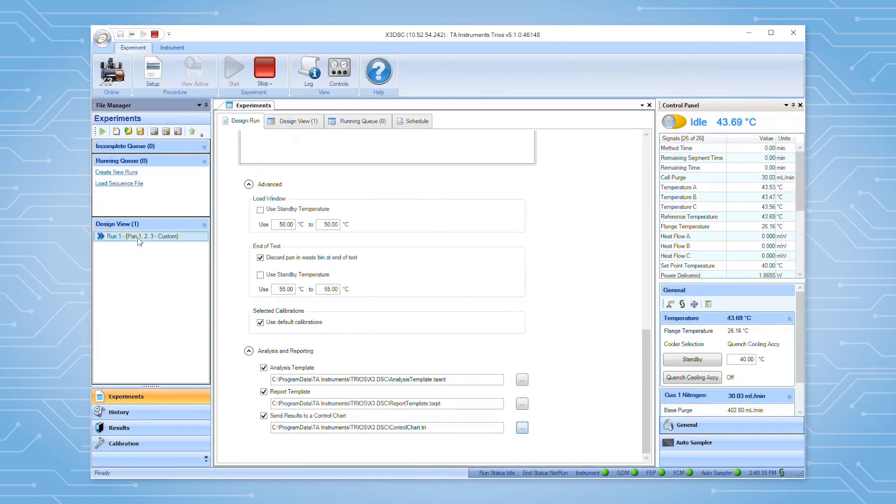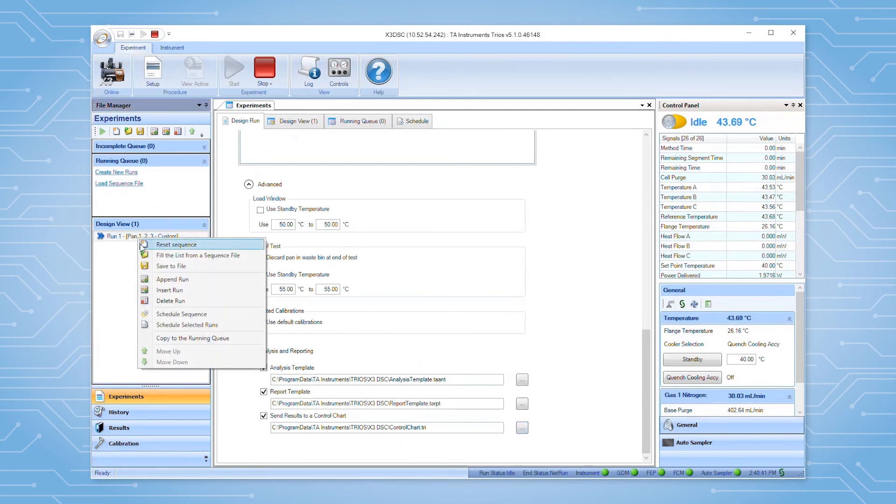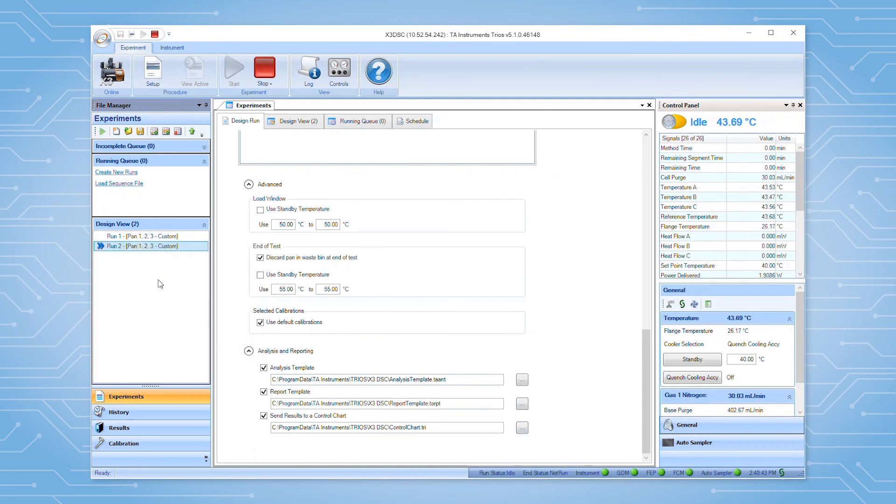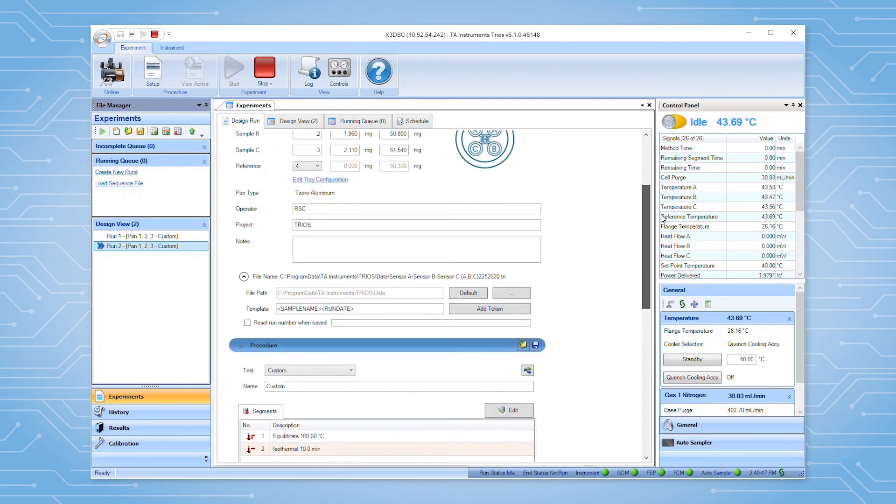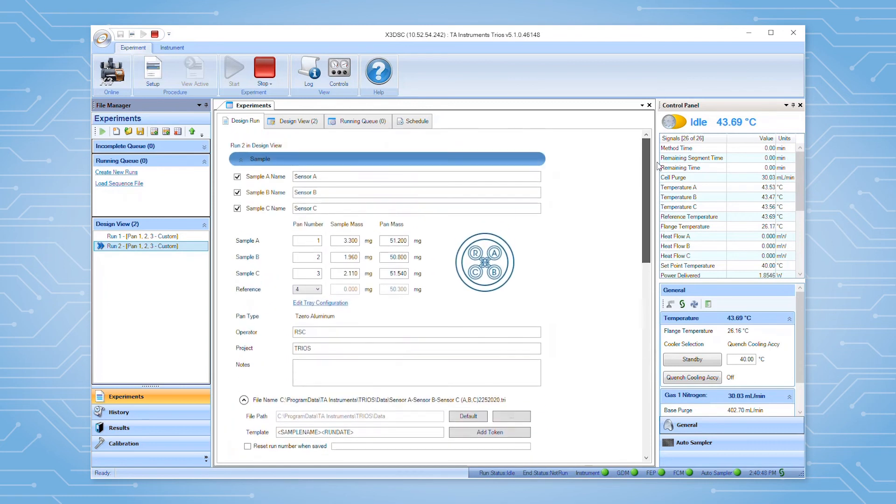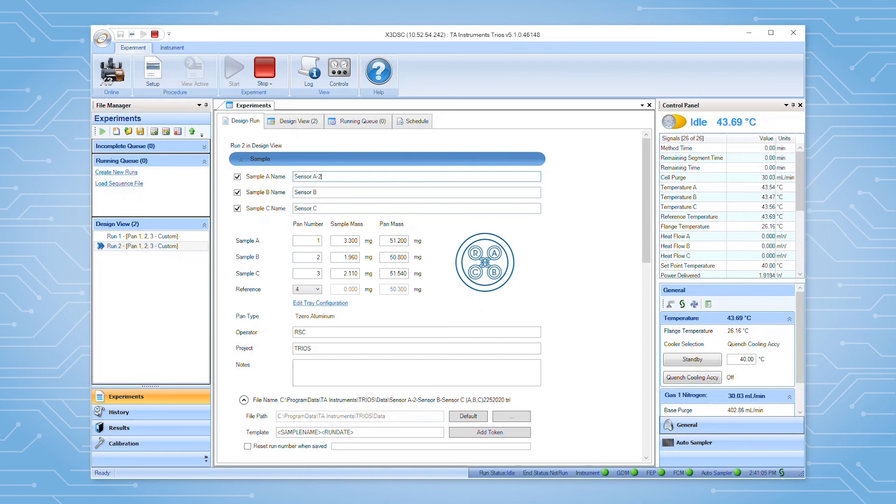After creating the first experiment, you can then append additional experiments to the sequence. The append function copies the sample and procedure information to the newly created experiment. If needed, this information can be modified to reflect new samples or test conditions to be run.